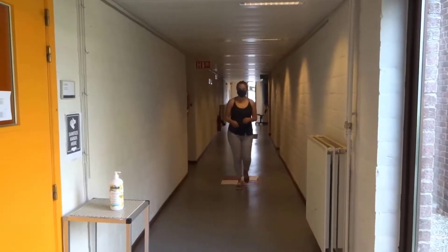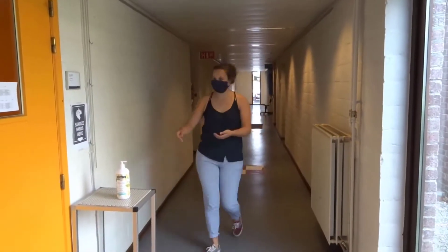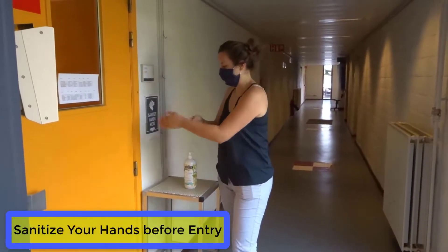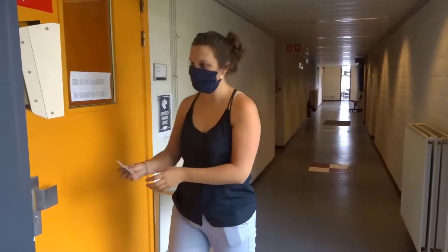You are about to enter WinFab. Please follow this new procedure. First, use the sanitizer to clean your hands, and use your UCL badge to open the door.